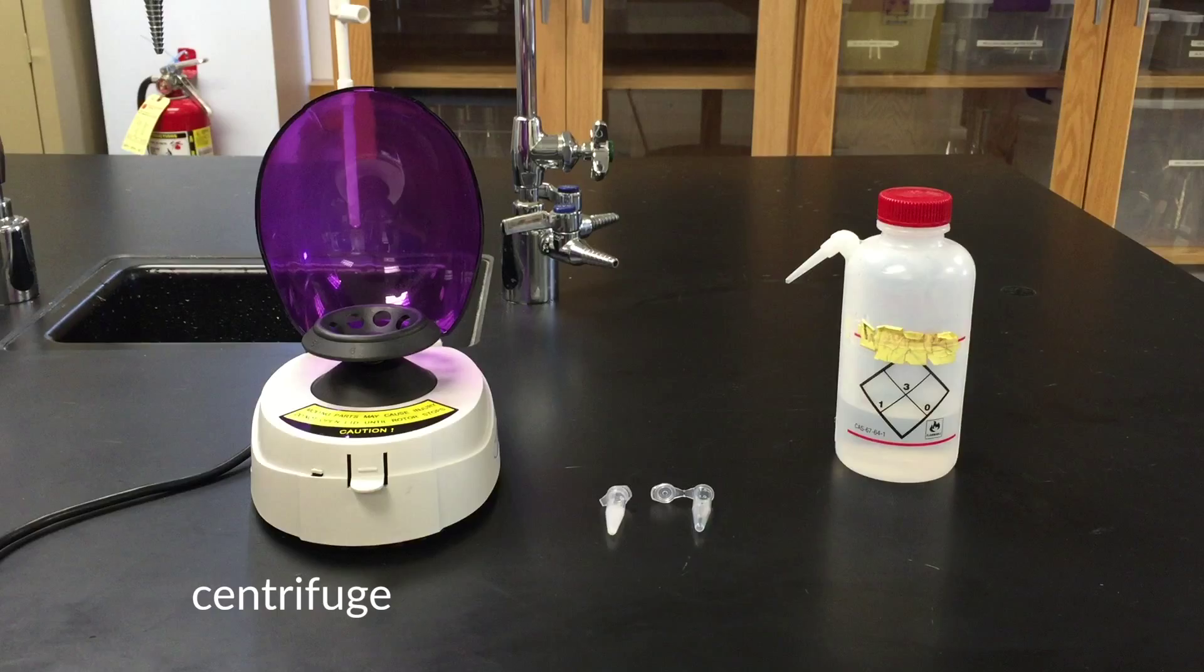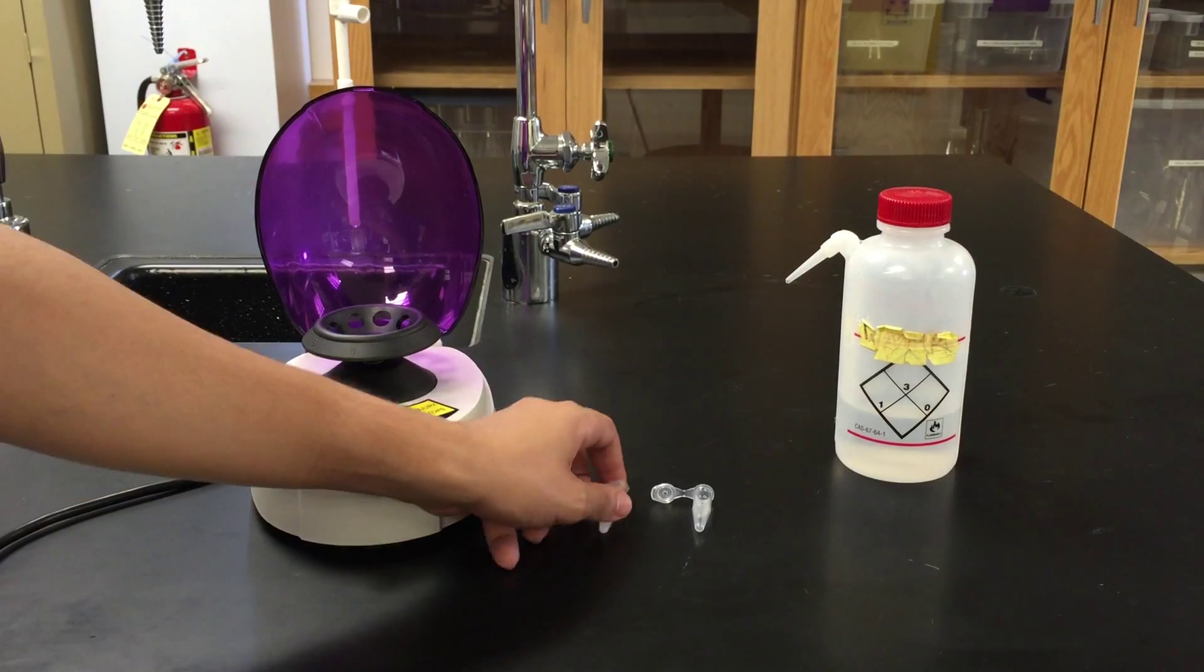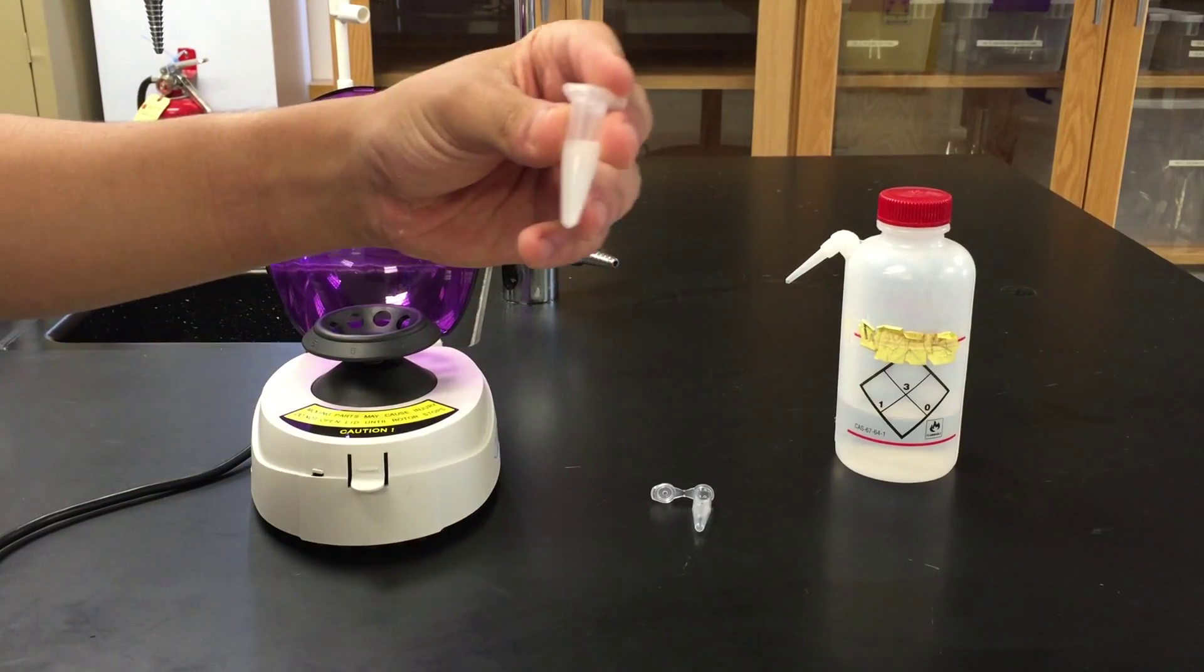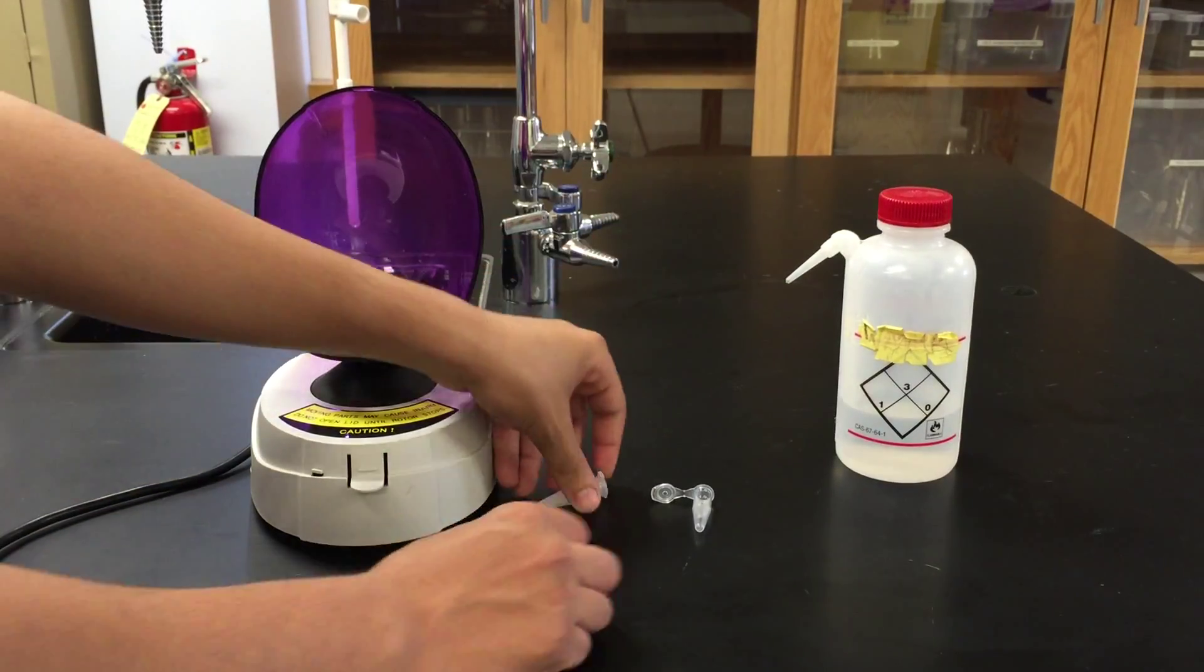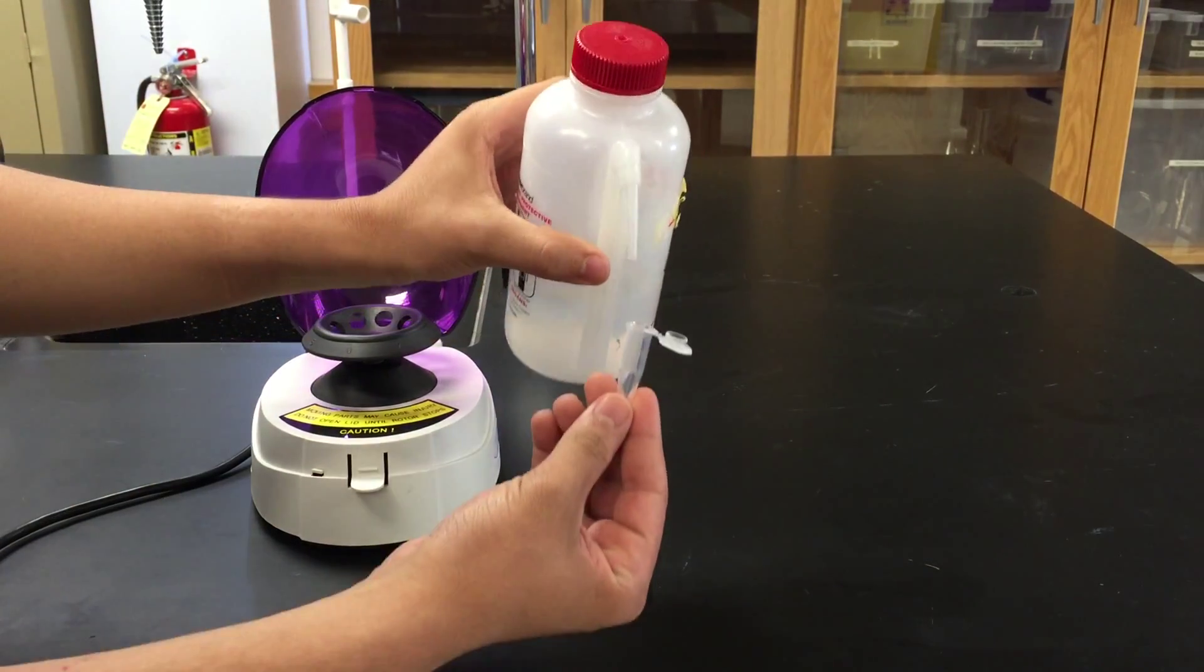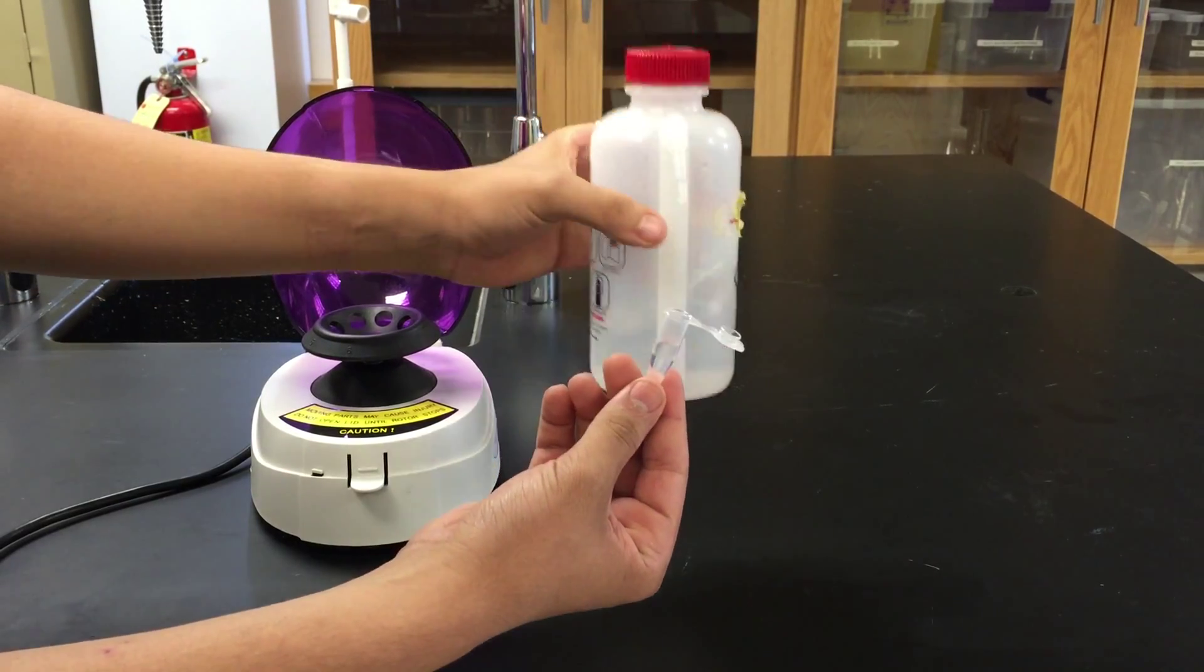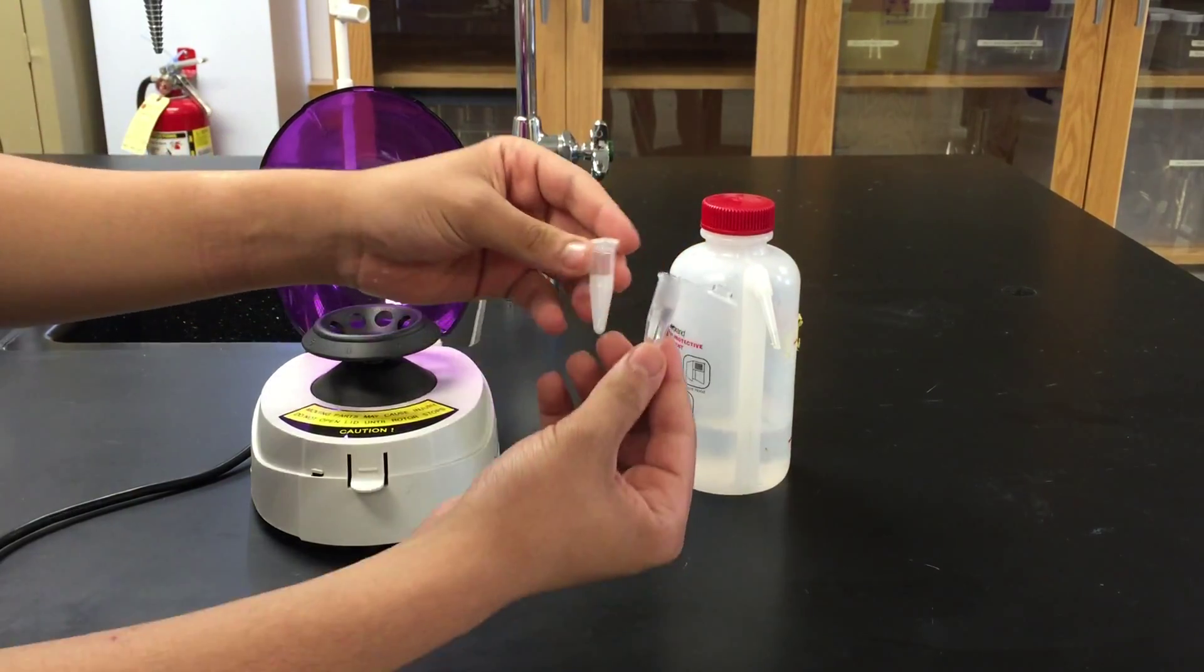Here we have a centrifuge, microcentrifuge tubes, and a DI water squirt bottle. The first tube has a solution from which we want to get the precipitate, and the second one we're going to fill with water, so that when we put the two tubes in the centrifuge, the machine will be symmetrical. Try to fill up the second microcentrifuge tube as close as you can to the volume of the first one.